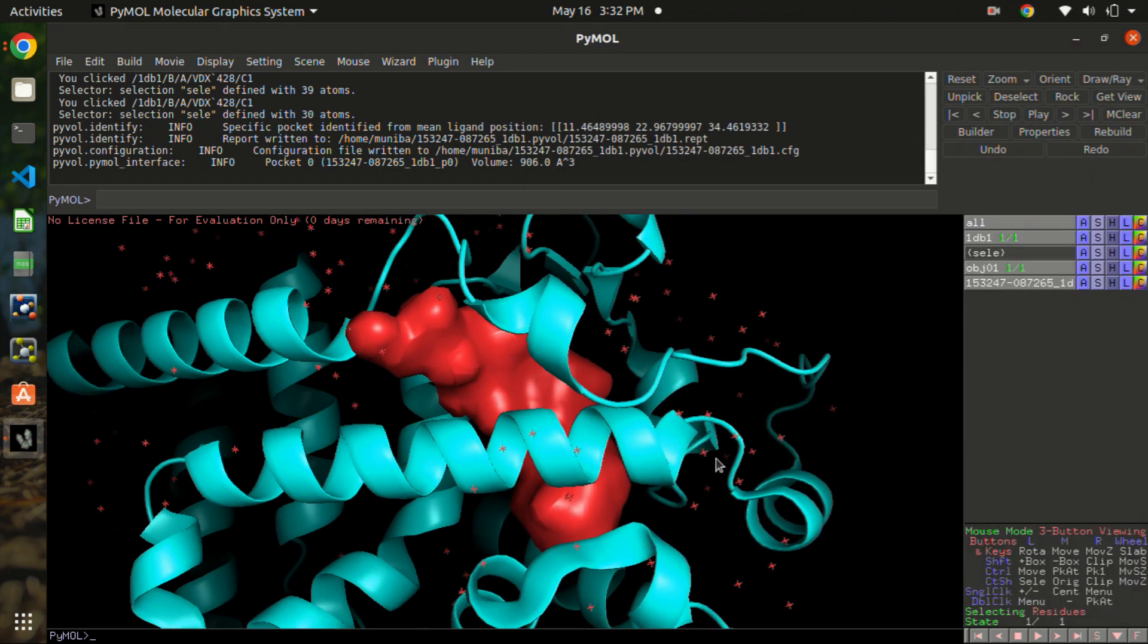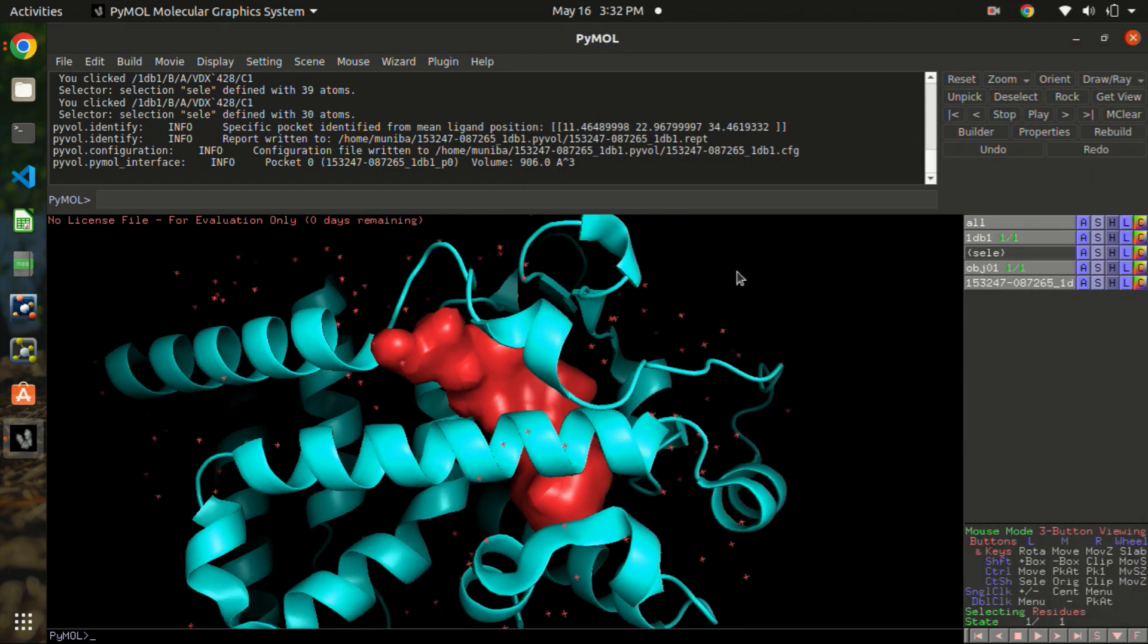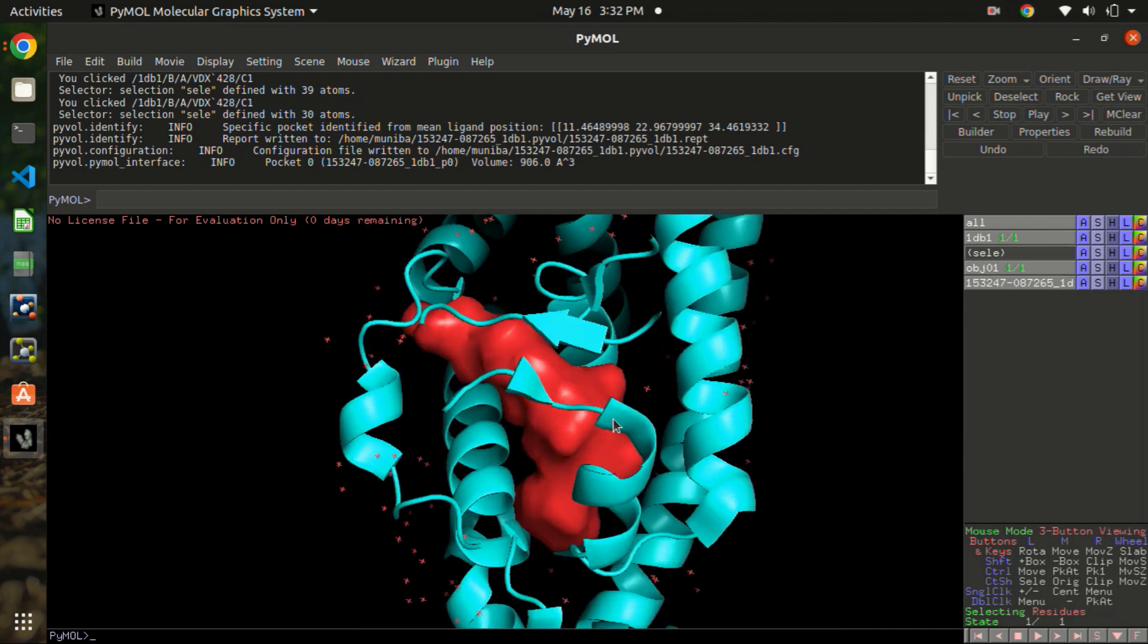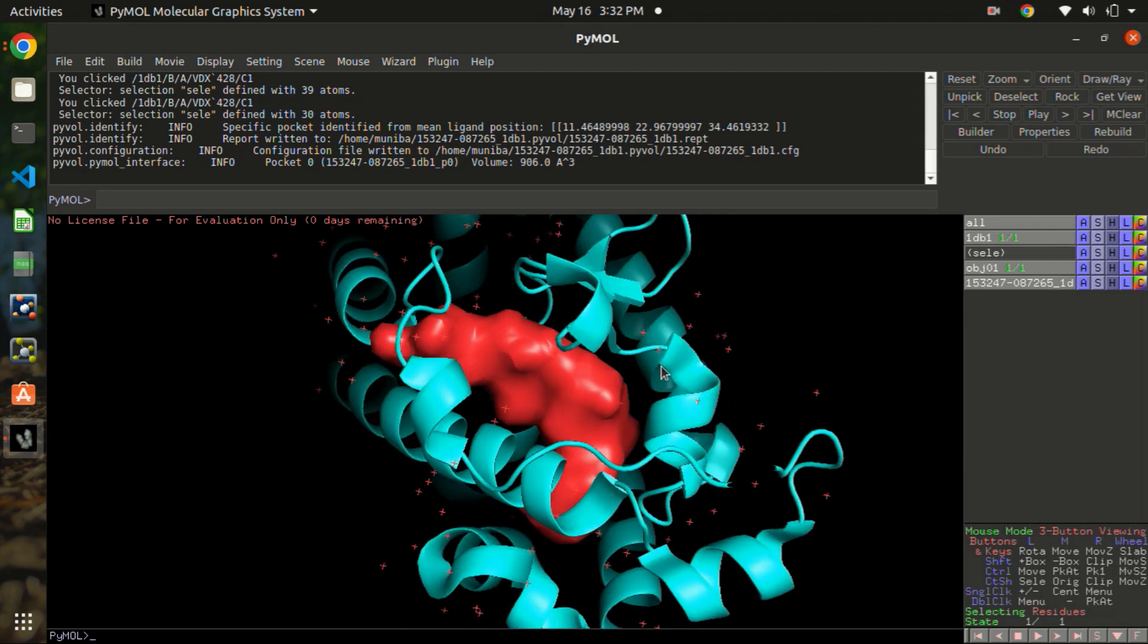So let's see here. This is the pocket that it was showing in the red solid. And now the volume displayed here is 906.0 angstrom.